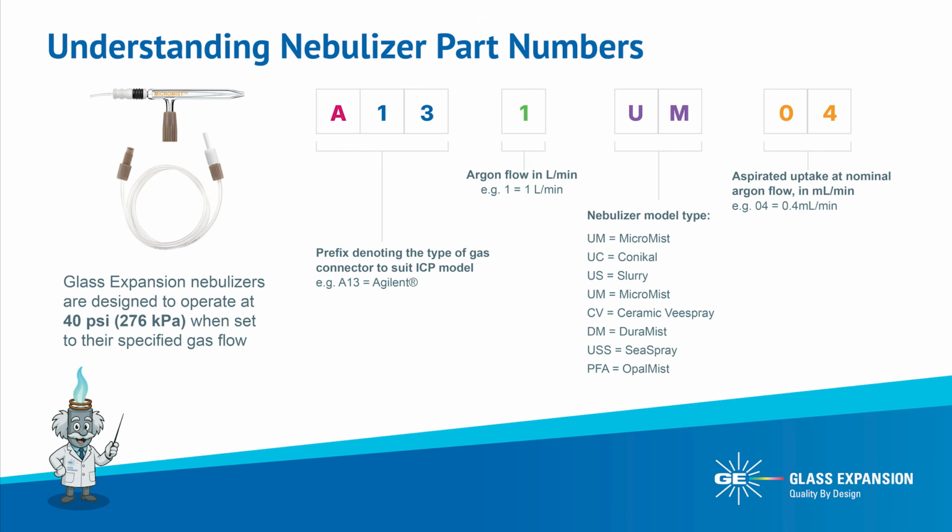The nomenclature of Glass Expansion's nebulizer part numbers provides helpful information with regards to what model the nebulizer is, the instrument compatibility, and what the recommended optimum nebulizer gas flow and sample uptake rates are.